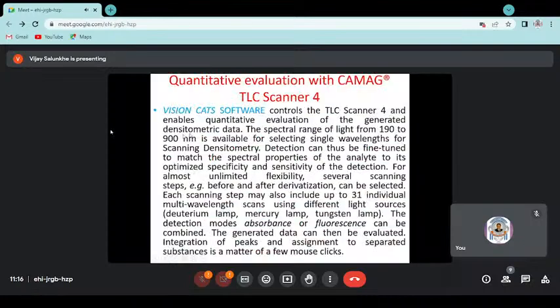At this stage, when you place your plate in that TLC scanner, there are detectors, UV detectors, so that UV rays can be applied to the spot or extract, and densitometric scanning takes place here. That means what you have studied in UV spectroscopy, ultraviolet spectroscopy, whenever you analyze your sample by UV, the same sample can be done by UV, IR, NMR, mass.